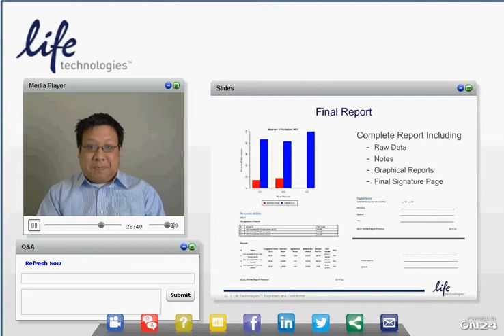In this case, the 95% detection limit is 90.3 IUs per ml. We can also calculate the confidence interval, which in this case is 75 to about 108.